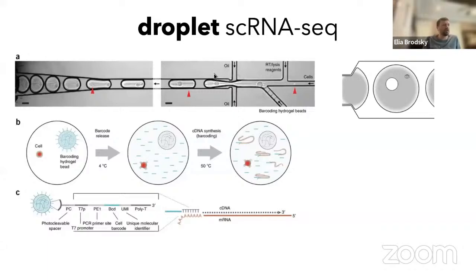And you can see that it encapsulates them into this oil bead, and then you can flow through and add the barcoding. So this is really a way to scale up and automate this whole process. And so the idea is that you encapsulate each individual cell inside a nanoliter droplet together with the bead. Then you can isolate the bead with the enzymes that are required to construct the library. And each bead will contain that unique barcode, because this whole process is going to be automated, right?